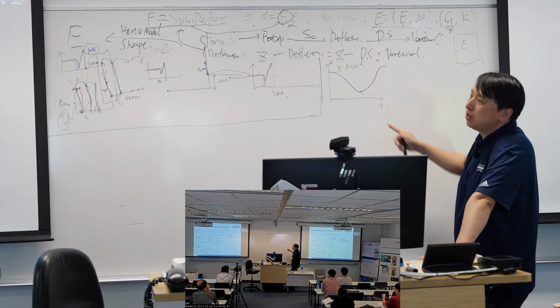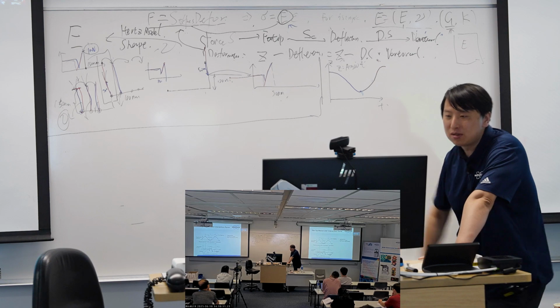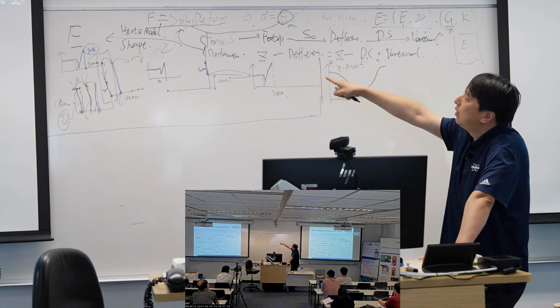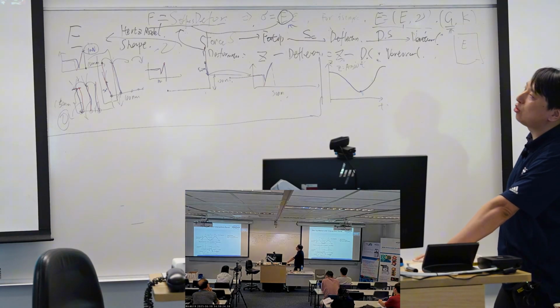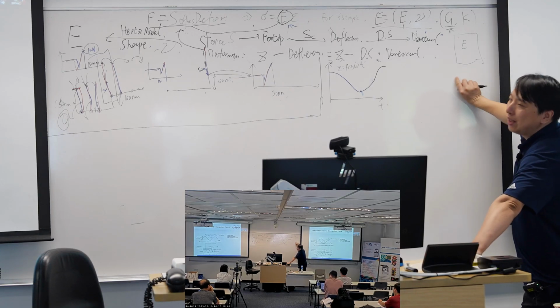But the problem is that we cannot do the force curve quite fast due to Newton's law. We have to reduce the speed of the force curves. As such, we cannot increase the speed, and it takes a long time to capture an image. So we think about another idea.